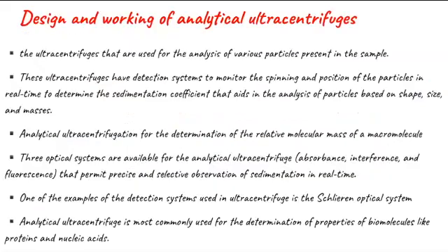Design and working of analytical ultracentrifuges. These are ultracentrifuges that are used for the analysis of various particles present in the sample. These ultracentrifuges have detection systems to monitor the spinning and position of the particles in real time to determine the sedimentation coefficient that aids in the analysis of particles based on shape, size, and masses.